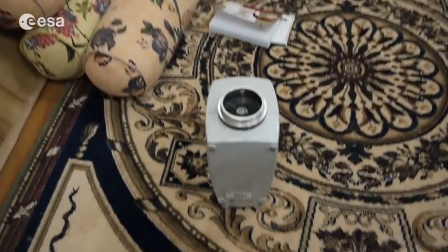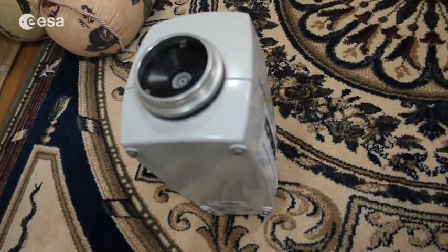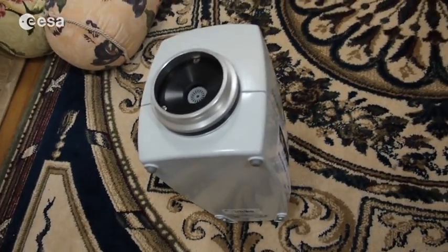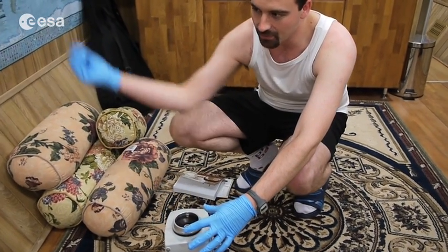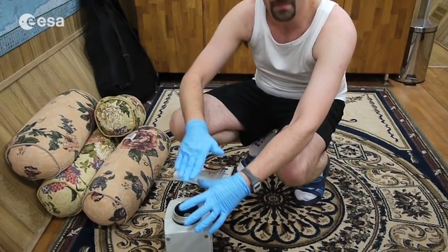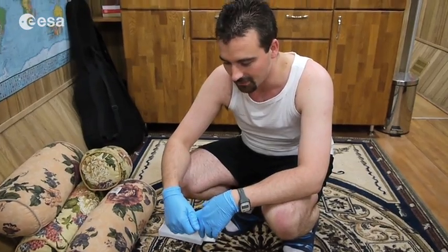And why do you need that machine to do that? This machine is just like a vacuum cleaner. It sucks air here, and with the filter on top of it, all the particles will be stuck to the glycerin filter.